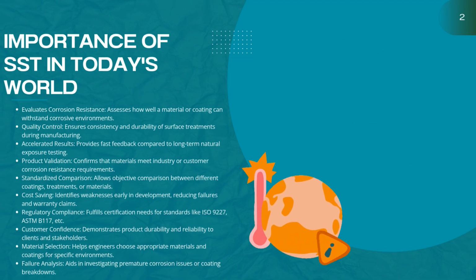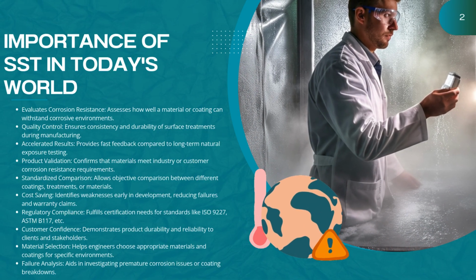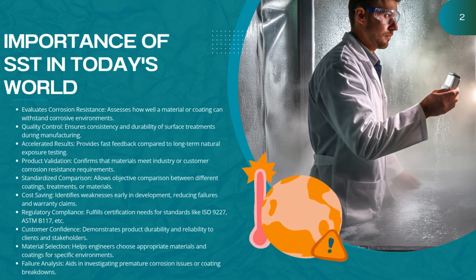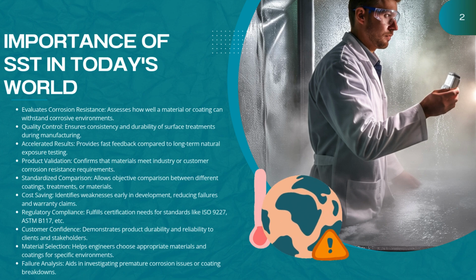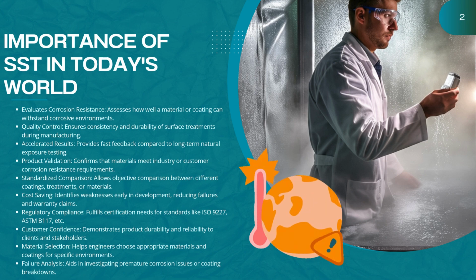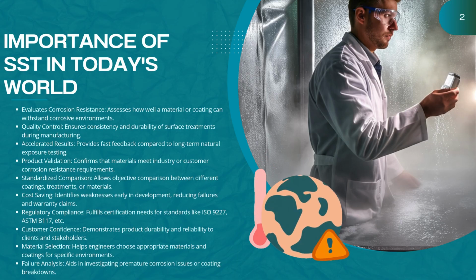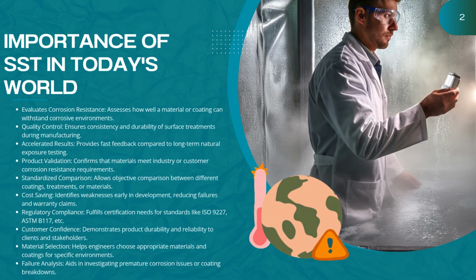Importance of SST in today's world. Let's talk about why salt spray testing matters in today's industry. It helps us evaluate corrosion resistance, making sure materials or coatings can survive harsh environments. From quality control and early failure detection to product validation and regulatory compliance, SST adds value at every stage.